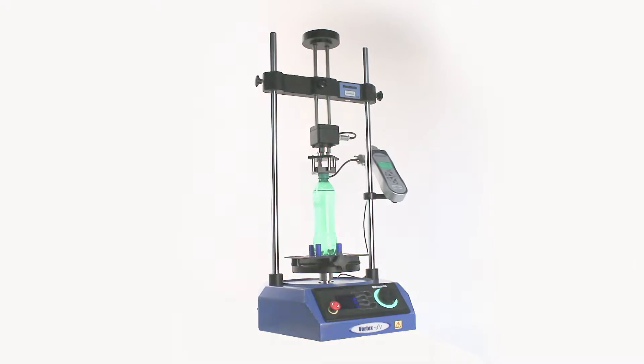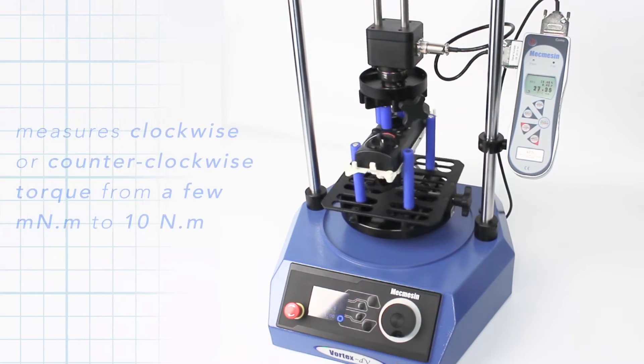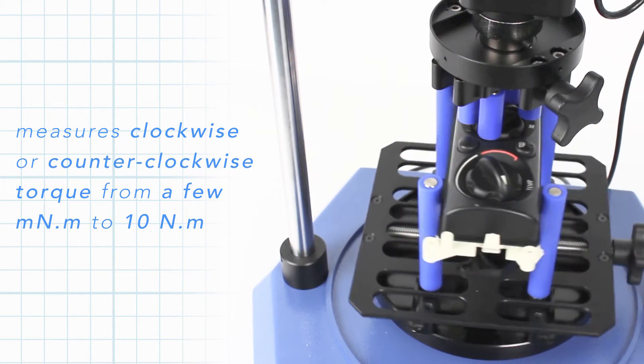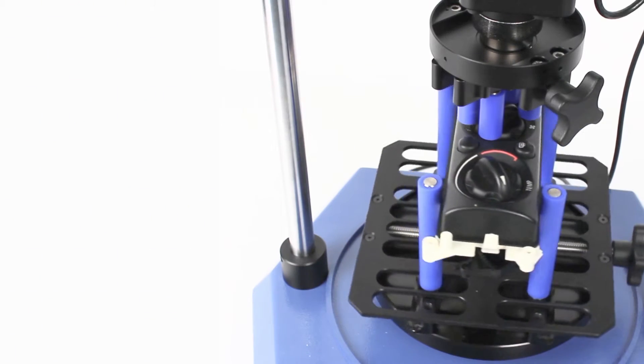Vortex DV measures clockwise or counterclockwise torque, covering the range from a few millinewton-metres right up to 10 newton-metres, ideal for many applications involving small rotary mechanisms.